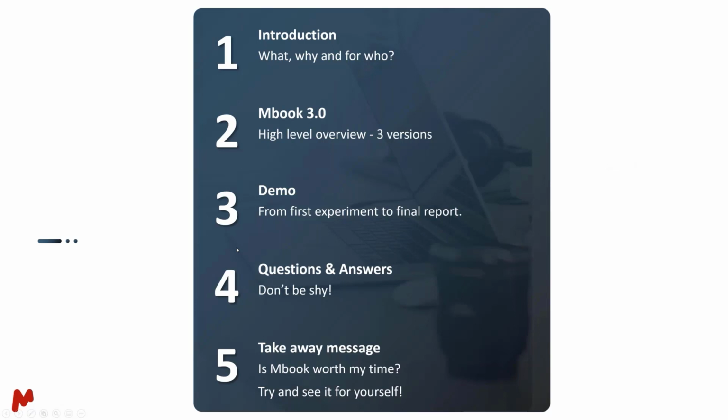With that, what we will be covering today will be an introduction: what, why, and for whom Mbook is developed. We will provide a high-level introduction and overview of the new three versions, or flavors, as we call them. And then, of course, we will jump into the demo. And anytime you wish, you can put in questions and we will answer them in the end.